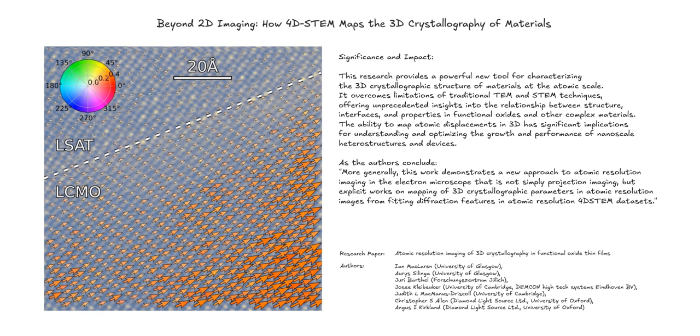In perovskites, the A-site refers to specific positions within the crystal structure, positions that are typically occupied by larger atoms. A-site modulation refers to coordinated displacements of these atoms. These displacements can significantly influence the material's properties, such as its conductivity, magnetism, and optical behavior. The ability to control the direction of these displacements essentially gives us a knob to fine-tune the properties of perovskites.